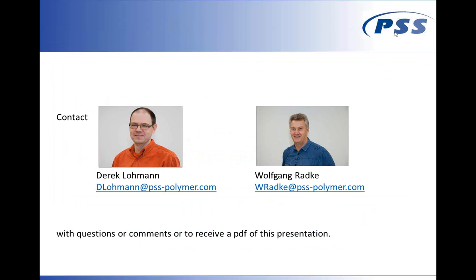To get a first estimate of where your critical composition might be, I usually like to run a gradient first. I have shown you that in a gradient, the eluent composition at the time of elution is very close, at least, to the critical conditions.